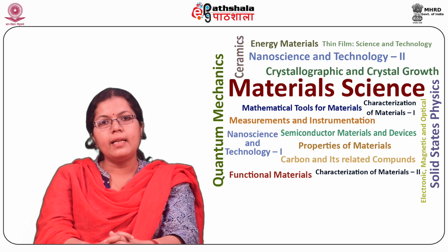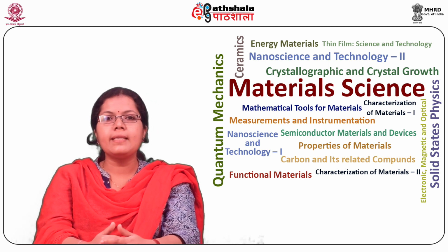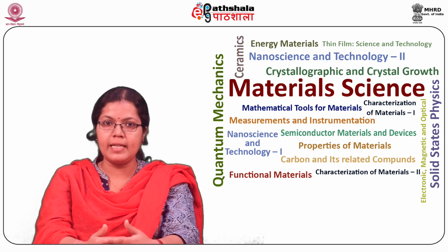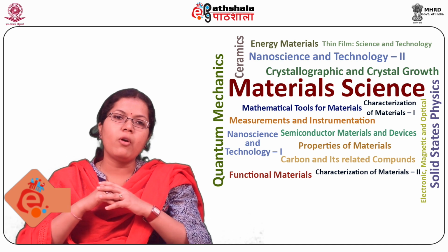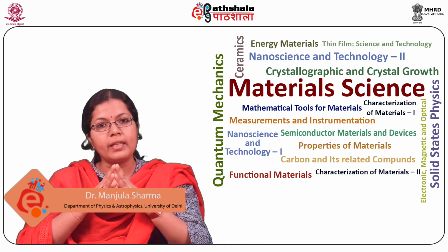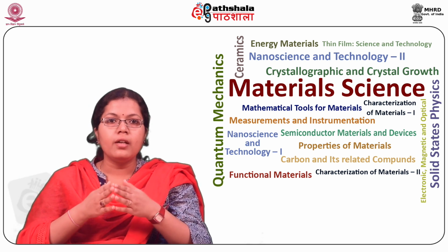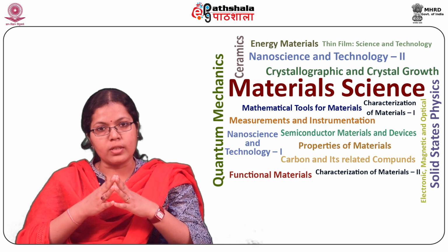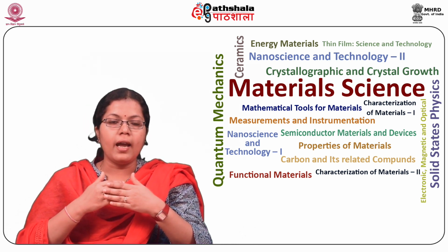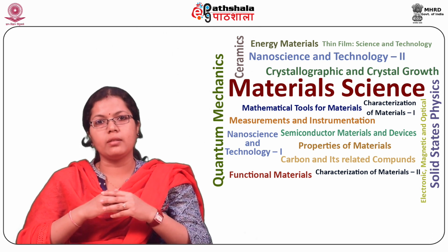So students, let us summarize what we have learned in this module. We have basically learned about the important instrumental features of SEM and TEM. We have learned about the basic electron optics. Then the electron optical elements and the attachments have also been described. We also learned about the electron sources, the thermionic emitter, and towards the end we learned about the field emission gun.